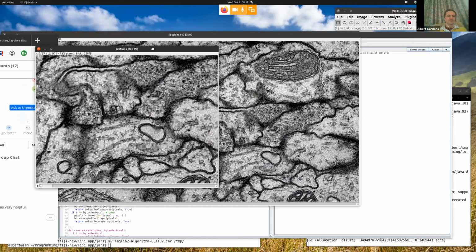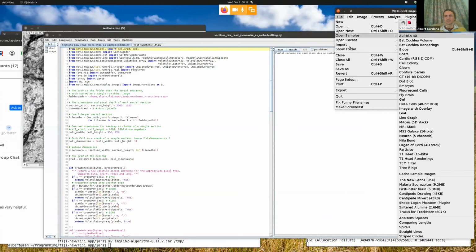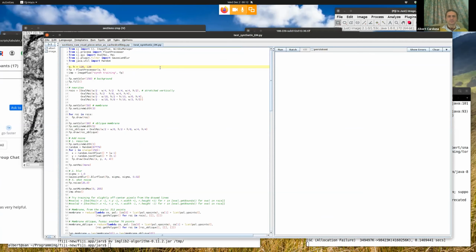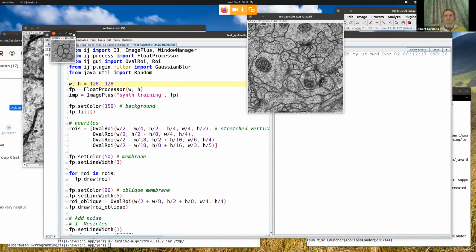Very good. Right, we wanted to work on this, and then we also wanted to open that sample image, that recent image, which was this one, and hopefully that script can now run. So I will explain what a script does in a moment. It's still running.